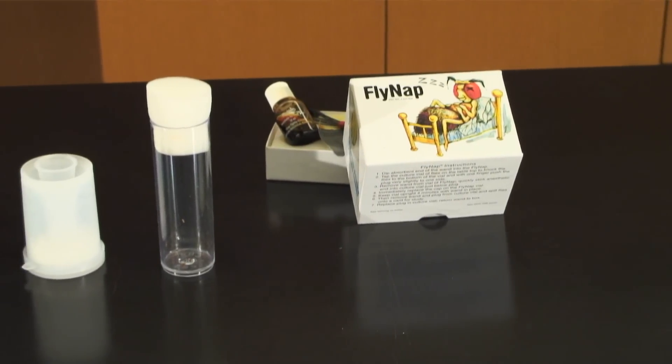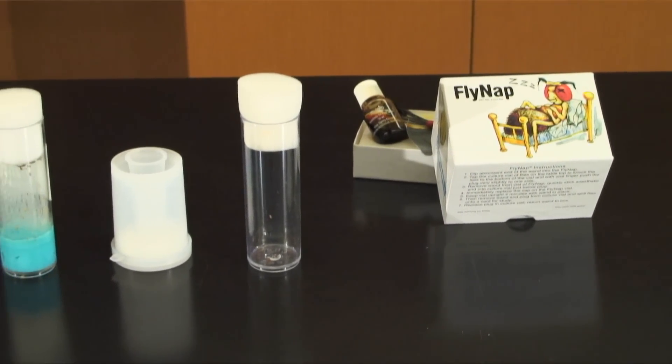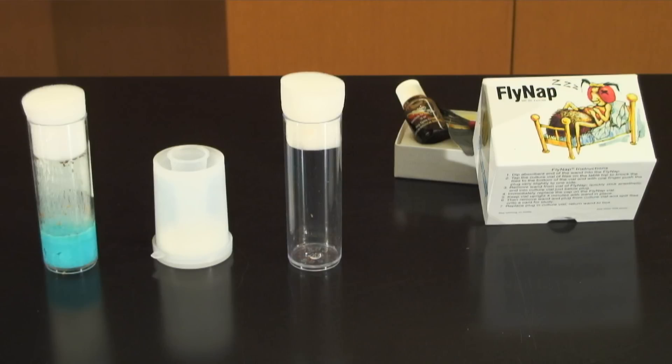Fruit flies can be anesthetized in an empty vial, in a Drosophila anesthetizer, or in a culture vessel.